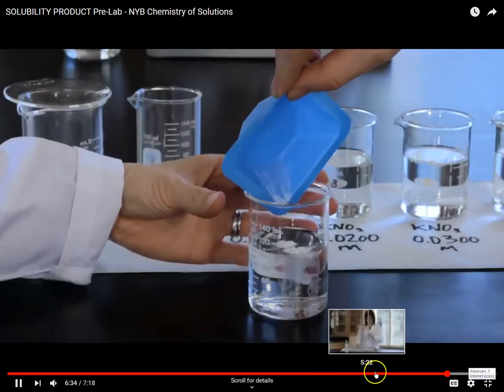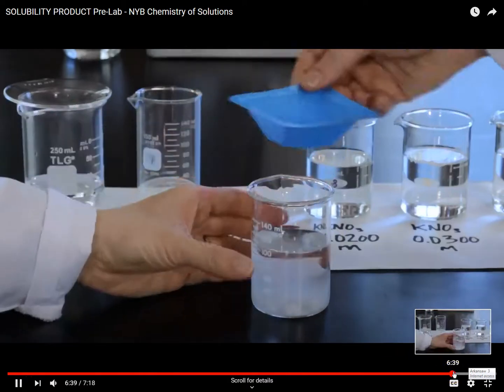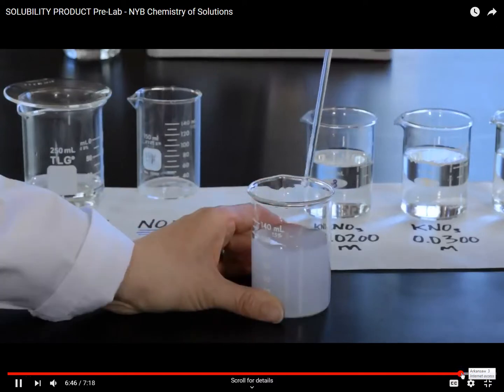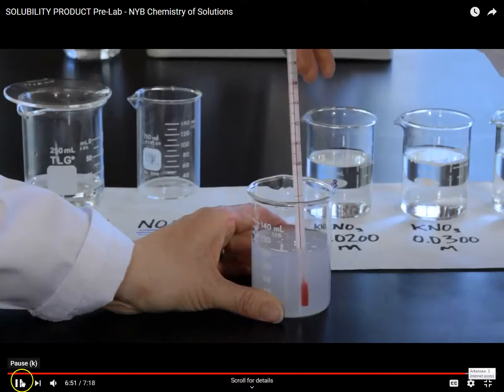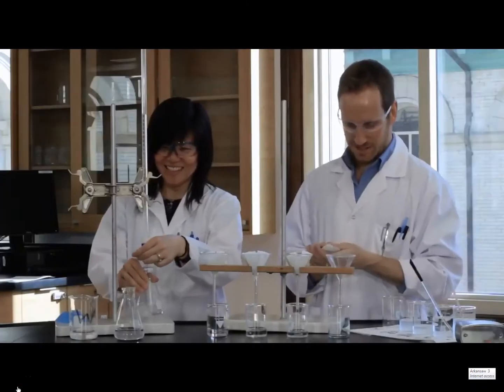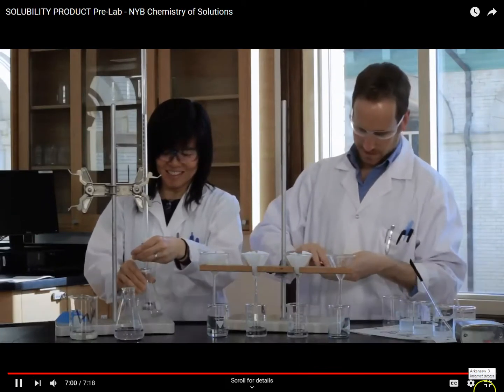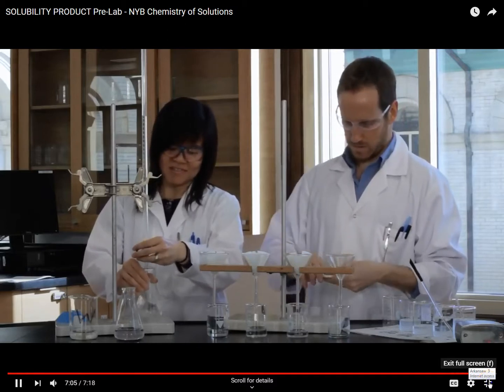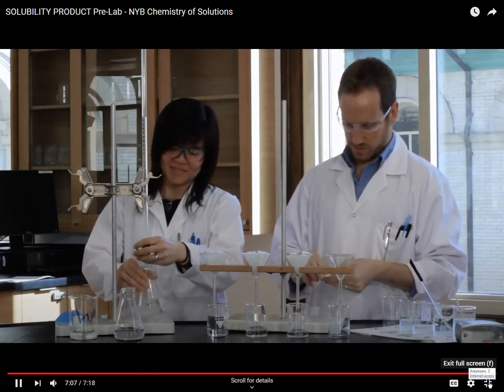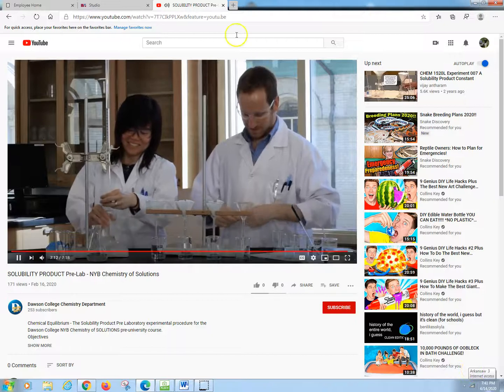Weigh out approximately 1 gram of potassium hydrogen tartrate and transfer the solid into a clean, dry beaker. And then the same thing, we're going to filter this. Record the temperature of the solution. Repeat the procedure with the remaining 3 solutions of potassium nitrate as the solvent. To be more efficient, while one partner is titrating, the other partner should be preparing another saturated solution of potassium hydrogen tartrate. Clean the glassware and put away the equipment.